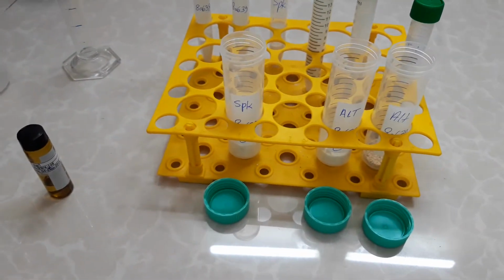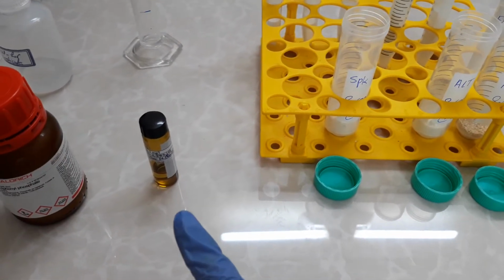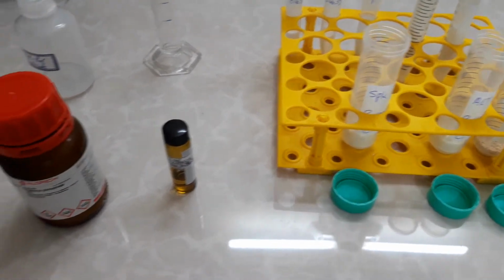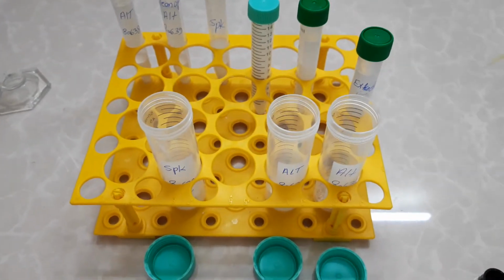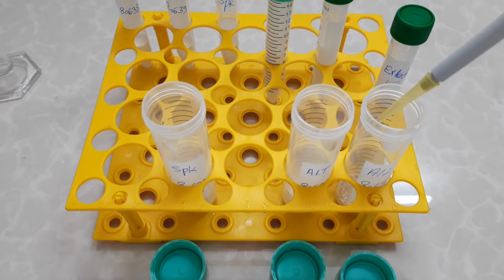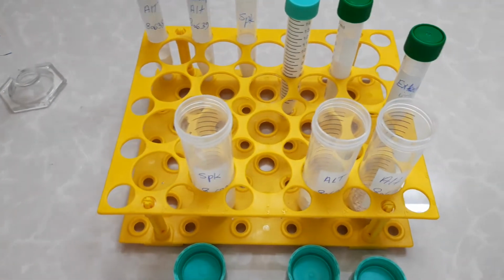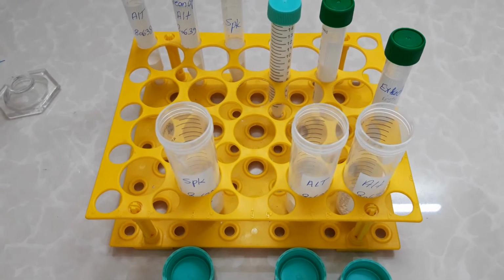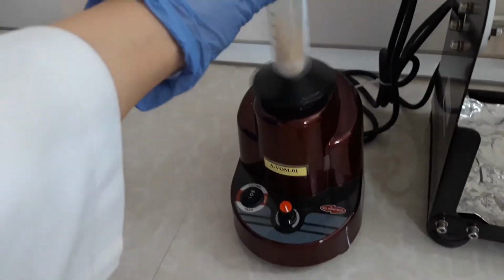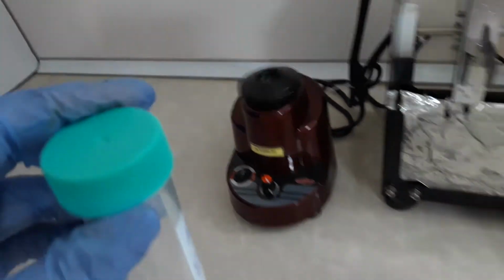In this step, I add 200 microliters of TPP with a 5 ppm concentration, as you can see. I will add the internal standard to the sample. Then we shake the sample and vortex it, and leave it for about 5 minutes. After that, we will start the next step.